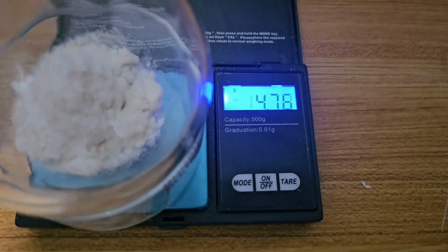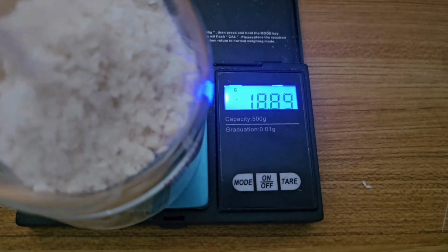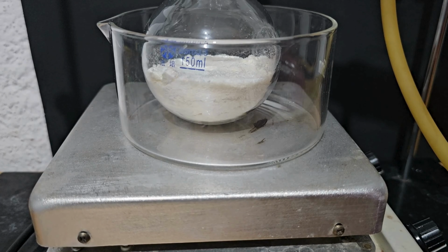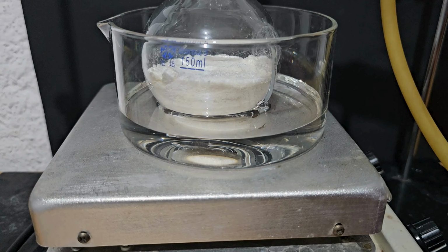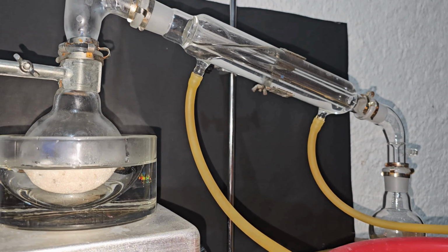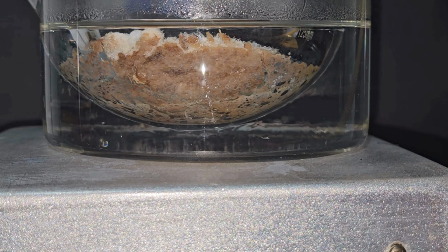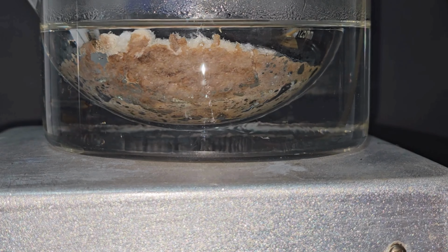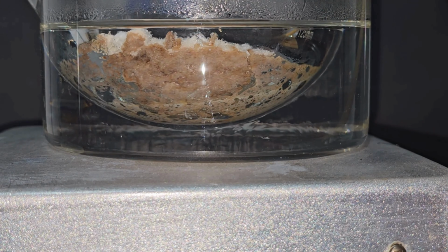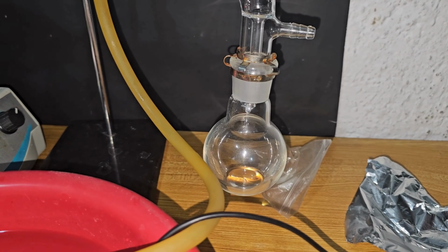For the aniline synthesis, let's start by weighing out 20 grams of para-aminobenzoic acid in a round bottom flask. I prepare the glycerin vat and immediately set up the simple distillation apparatus. As the vat reaches the melting point of para-aminobenzoic acid, some bubbles start forming. This is CO2. After some minutes, the distillate starts coming out.